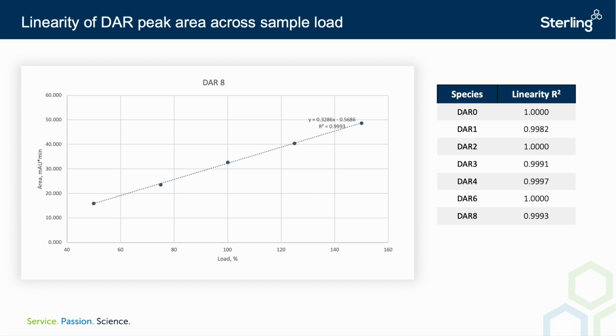A nonlinear DAR rate, for example, could lead to underestimation of the average DAR. This slide, showing the linearity of DAR rate, one of our smaller DAR peaks for SDE100, shows the method is linear at all potential loads.